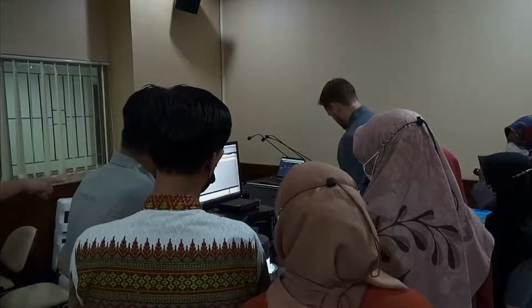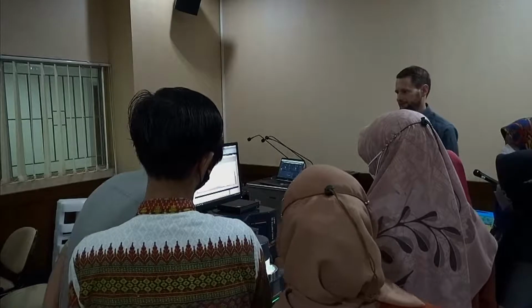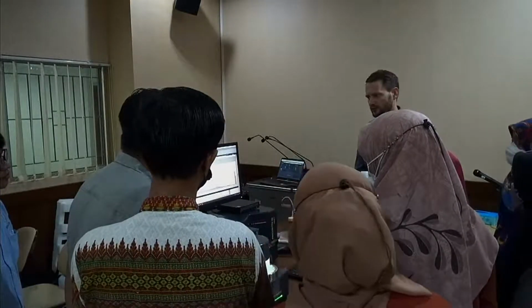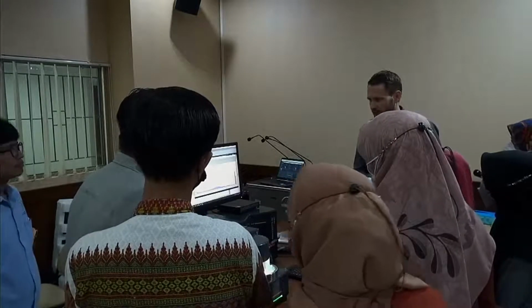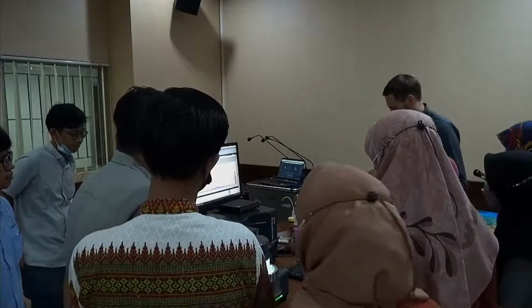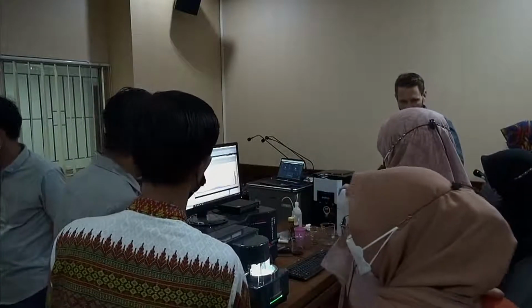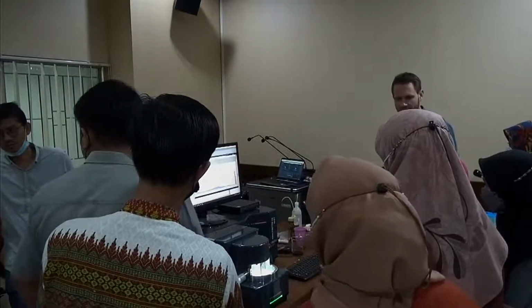Somebody filled that up, that's good. So of course you don't have to do 3 consecutive measurements, you can do 2, you can do 5, that's up to you. What I often do, in order to find out whether ultrasonic has an effect on my sample, is make myself an SOP where I have no ultrasonic in the beginning, then I make 2 consecutive measurements, then I switch the ultrasonic on, then I make another 2 consecutive measurements.